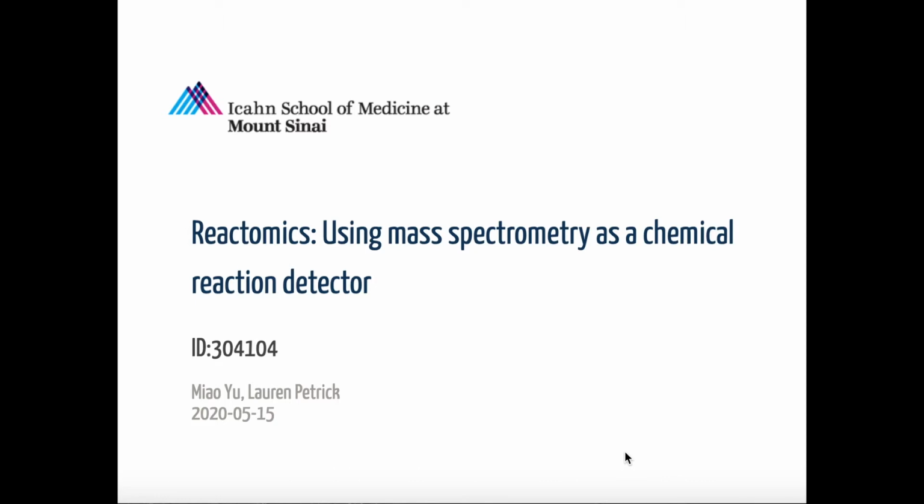My title is Reactomics, using mass spectrometry as a chemical reaction detector. I know it's another omics, but I think this one will make your life easier.